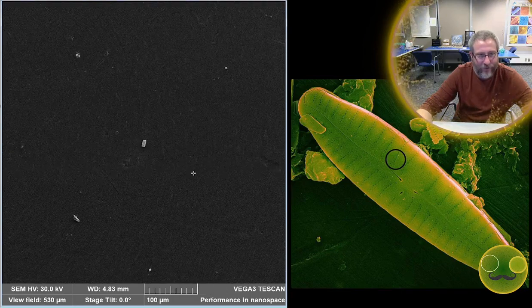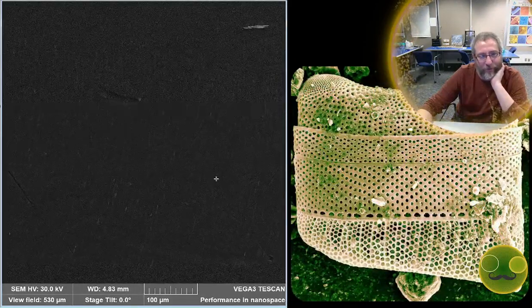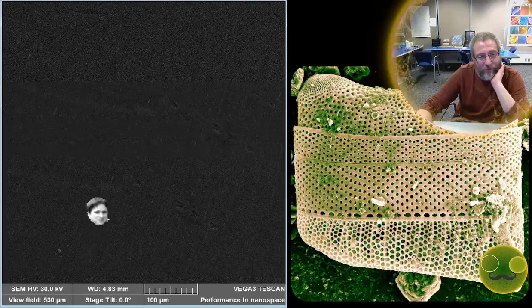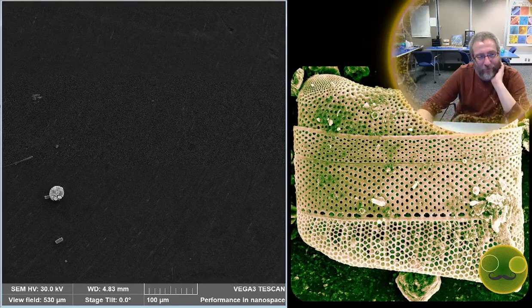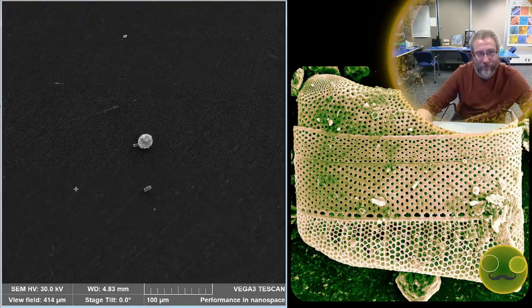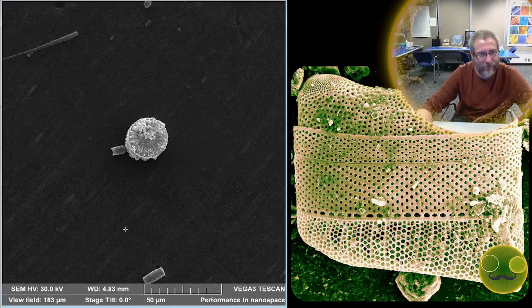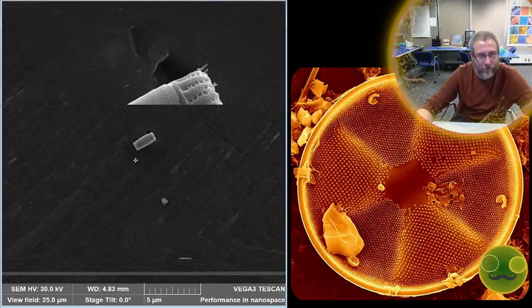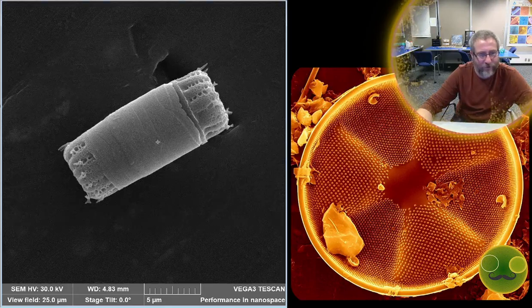And I think if I'm here, I'll still be able to see what we're looking for, like this height. That's actually part of the challenge, is trying to be far enough out that you can see most of this sample. Oh, that's like a weird Stephanodiscus. Should it be in there? I think this is the actual one that I imaged on the Twitter view that we have, which is okay.